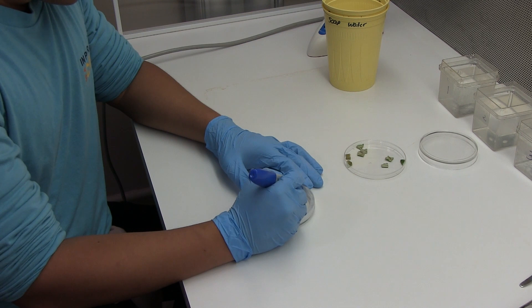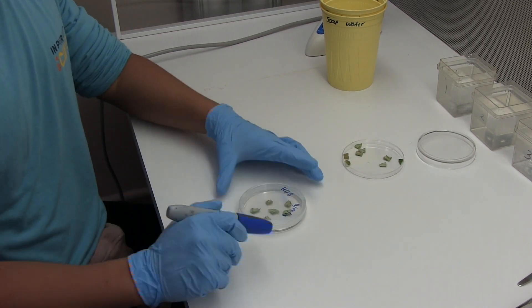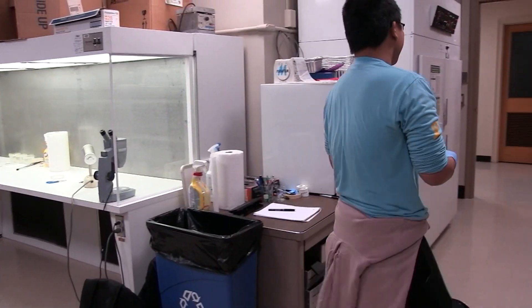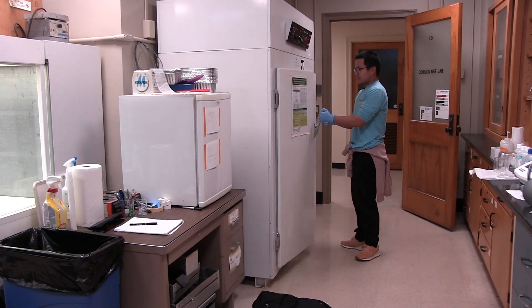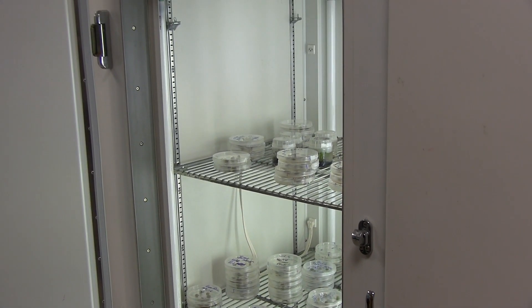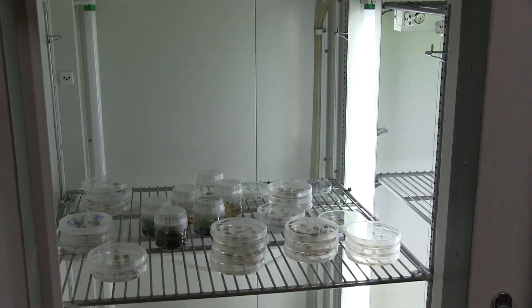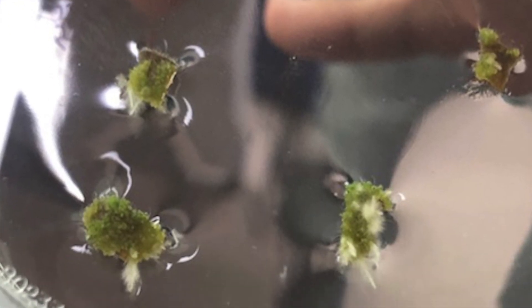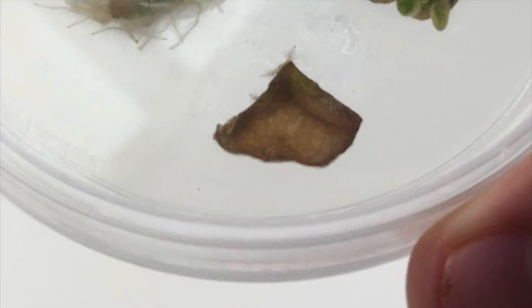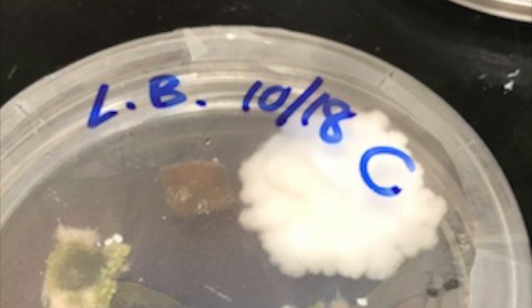Label your dish with name and date. Bring the finished tissue culture plate to the incubator and place on the rack under the lights. Check back periodically, but in six to eight weeks you should see new shoot and root development. If contaminated, you will see abnormal growth and color in the petri plate.